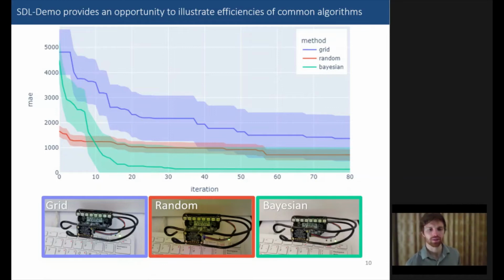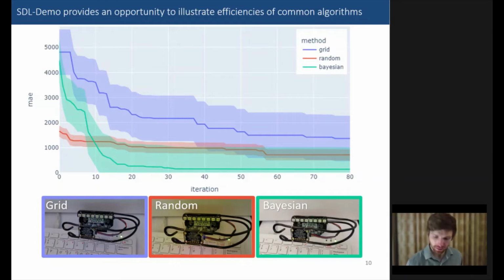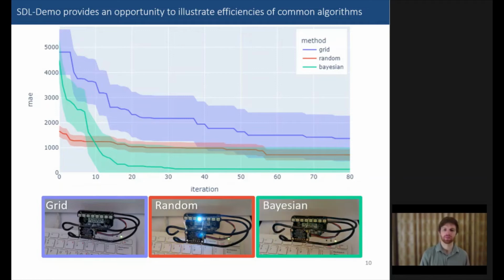And we can take a look at what each of these searches look like qualitatively. So with the grid search, you can see that it's starting from 0 power and then increasing the brightness for a fixed color and then moving on to a somewhat different color and it repeats that. Whereas with random search, you'll see that it's picking random intensities, random colors. As the name implies, you're getting just a random search, which can be fairly efficient and generally more efficient than grid search. And last, we have a Bayesian optimization algorithm, which there's some great resources for understanding on Towards Data Science, and I encourage you to look at those if you're not familiar.